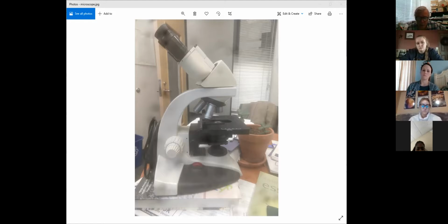And again, hard to see it. It's in front here that turns something called the diaphragm. It's part of this black thing underneath here called the substage condenser. We generally don't use a substage condenser, but in a substage condenser is this diaphragm.